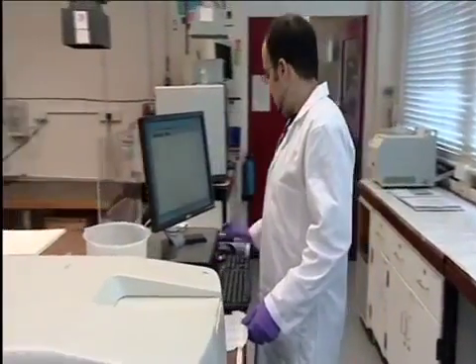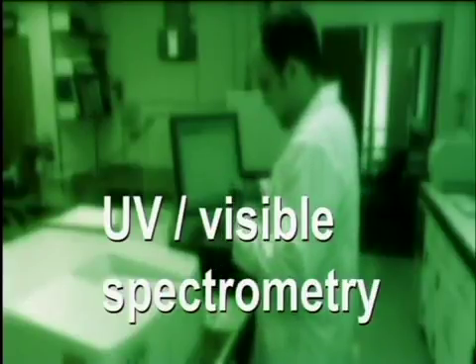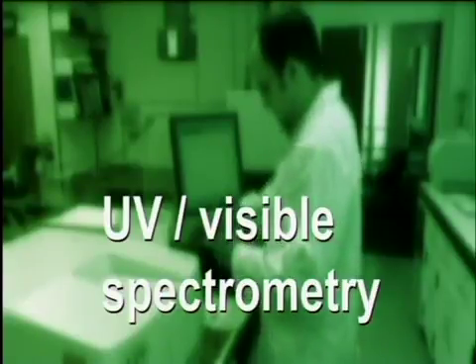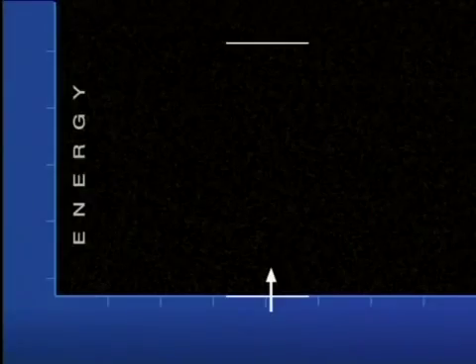Ultraviolet visible spectrometry tells us about electronic transitions in atoms and molecules. Spectra are produced when electrons in molecules or atoms move from one electronic energy level to another of higher energy.